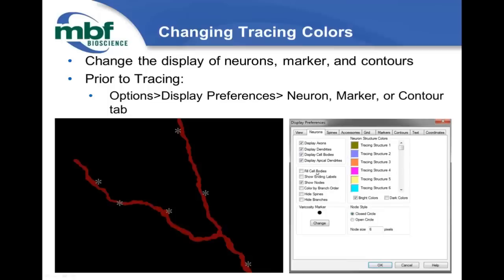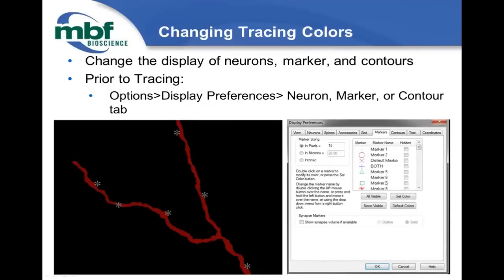For markers, you can change the marker name to be specific for the cell type you're working with and click on the symbol to change the color. In terms of marker sizing, you can show markers in pixels or in microns — you might want to make them bigger if you're exporting and want the markers to pop. You can also use intrinsic mode, which lets you modify the size of each marker you place depending on what you're marking.